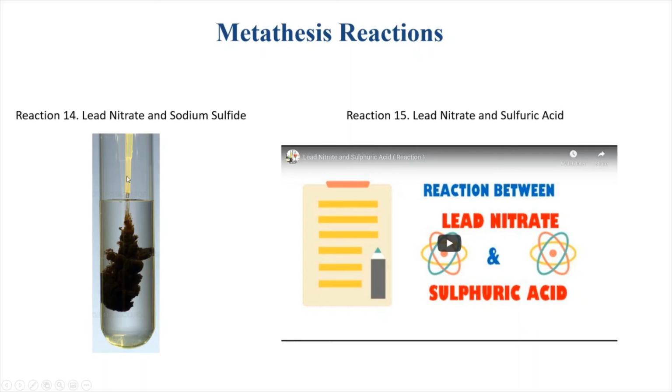And the sodium sulfide again has this sort of yellowish color that's consistent with the sulfide. And the lead nitrate is a clear colorless solution. And when you add the sodium sulfide into the lead nitrate, you get this blackish brown precipitate that forms very rapidly, and it basically blacks out the whole solution. If you were to centrifuge this down, this black precipitate would be at the bottom, and you would have this colorless transparent solution at the top.